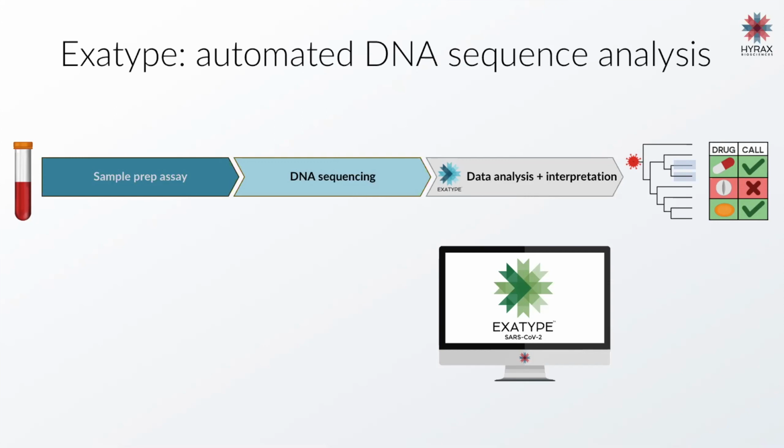So what we're going to show you today is a solution of how we've deployed SARS-CoV-2 lineage or clade typing through the Exatype platform. But really, as you see, what we strive for with our software is to make it as simple and intuitive and as easy to use for the end user. And so firstly, Natasha, my colleague, our CSO, is going to give a little bit of an overview about the minefield that is currently SARS-CoV-2 lineage and clade typing. And then Imogen is going to provide you with a demo of the software solution.